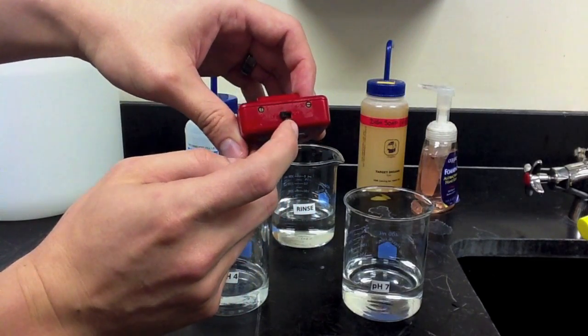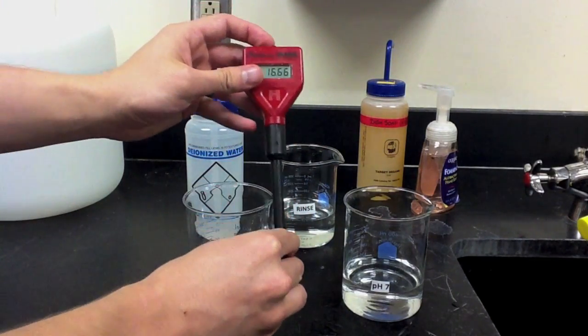We'll start by turning the pH meter on and then removing the cap from the bottom of the electrode.